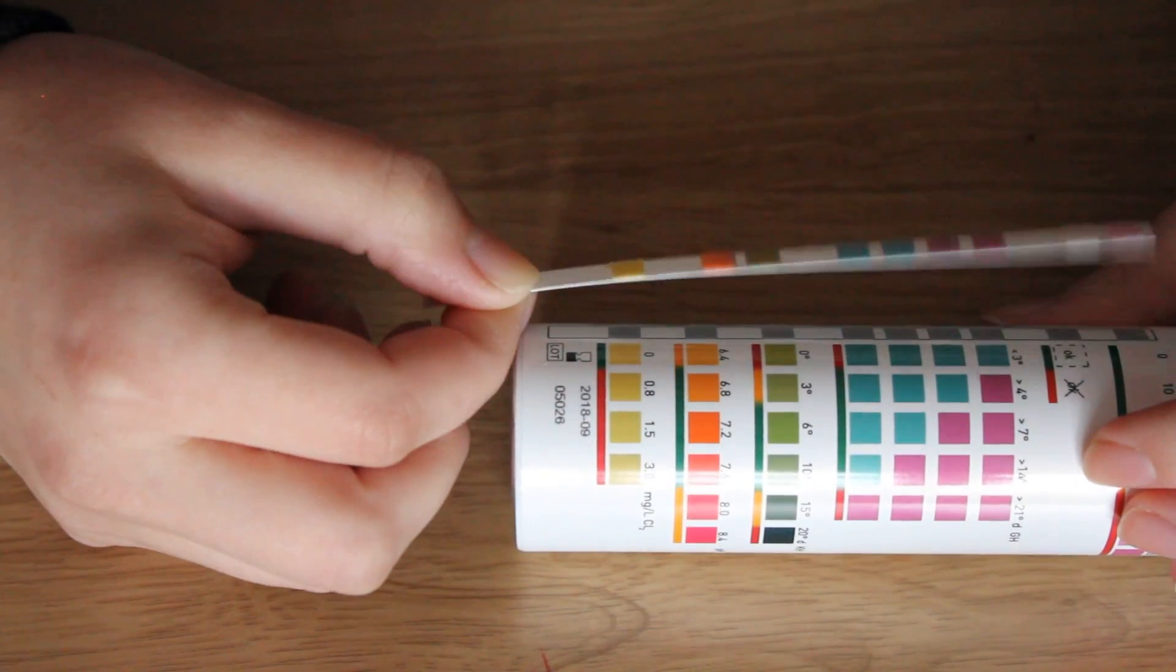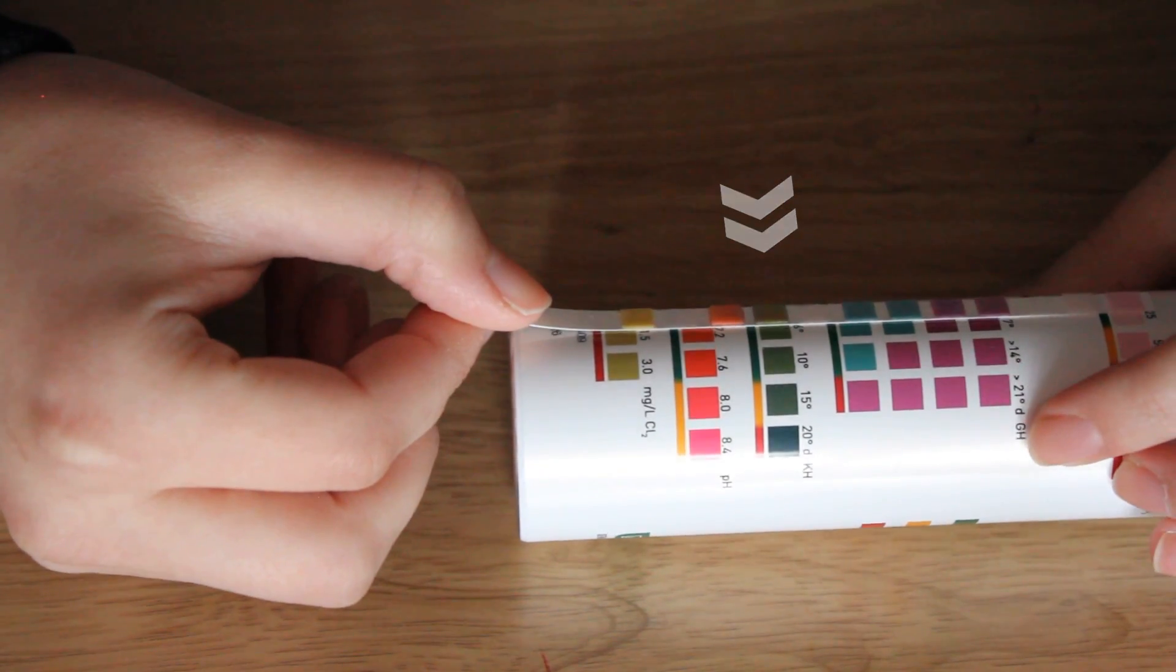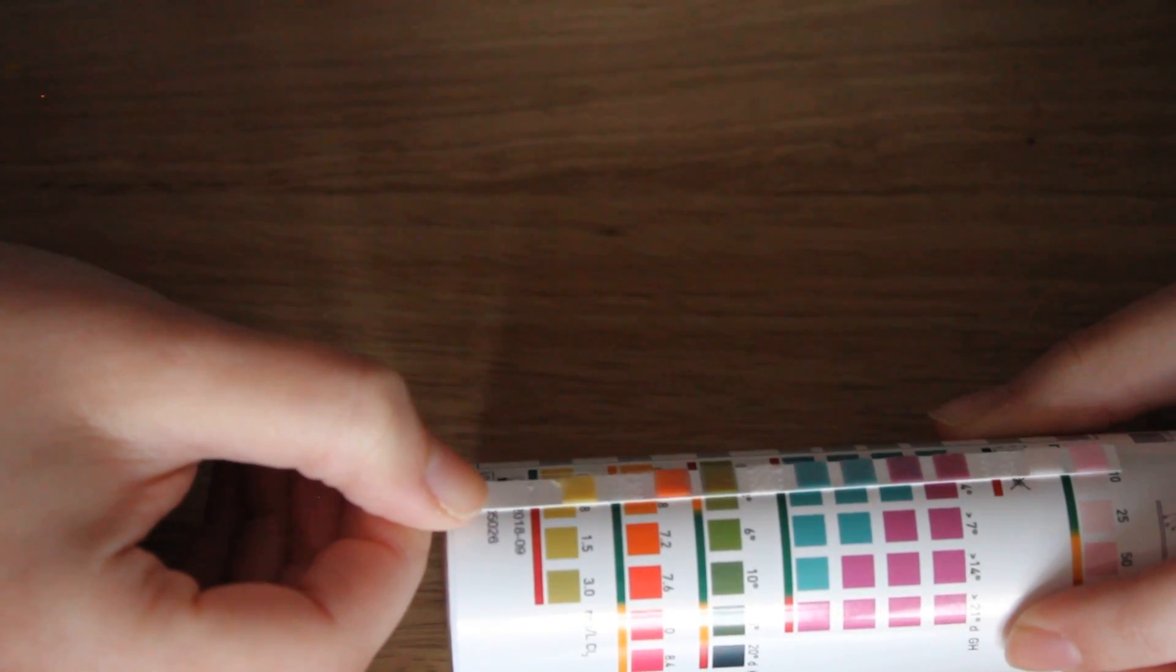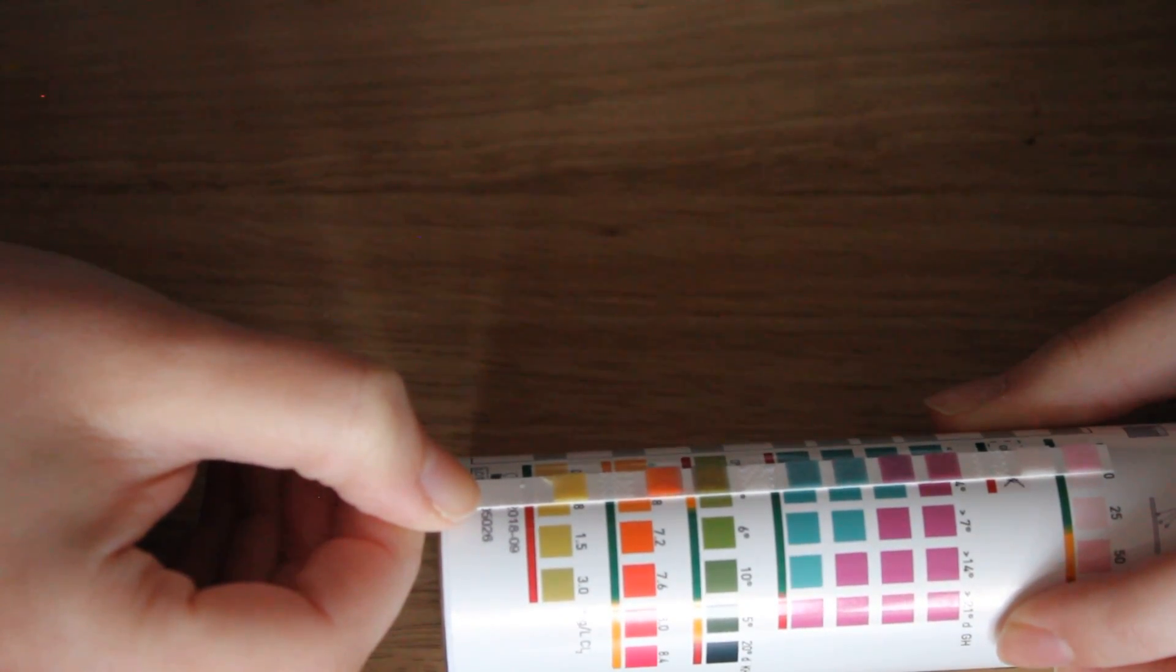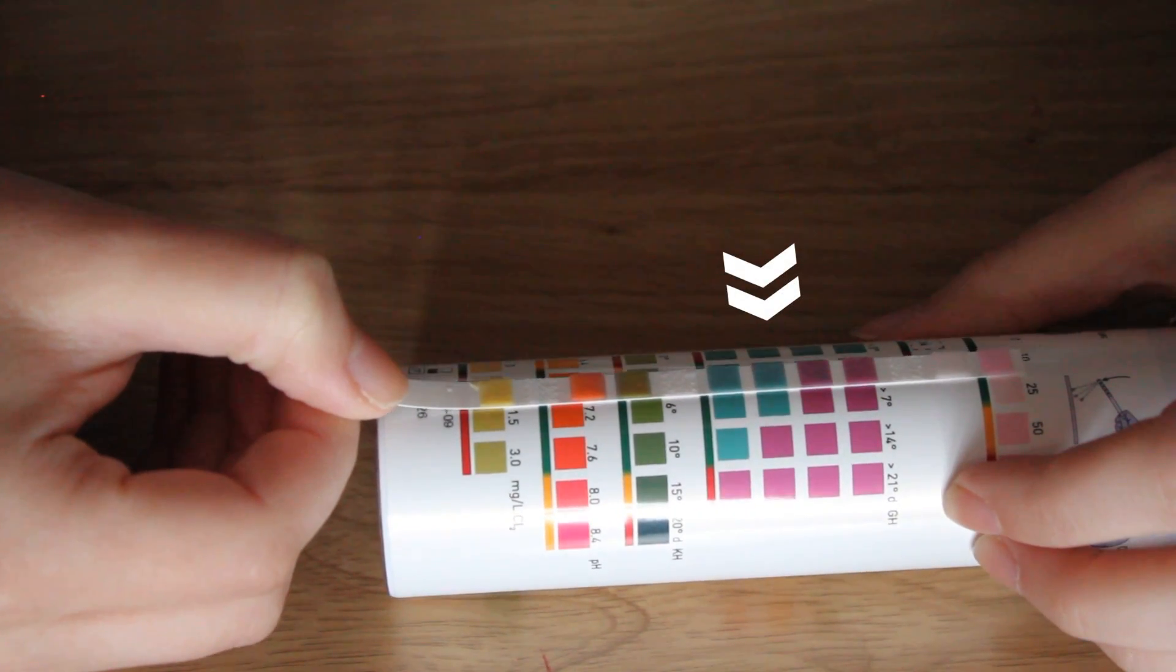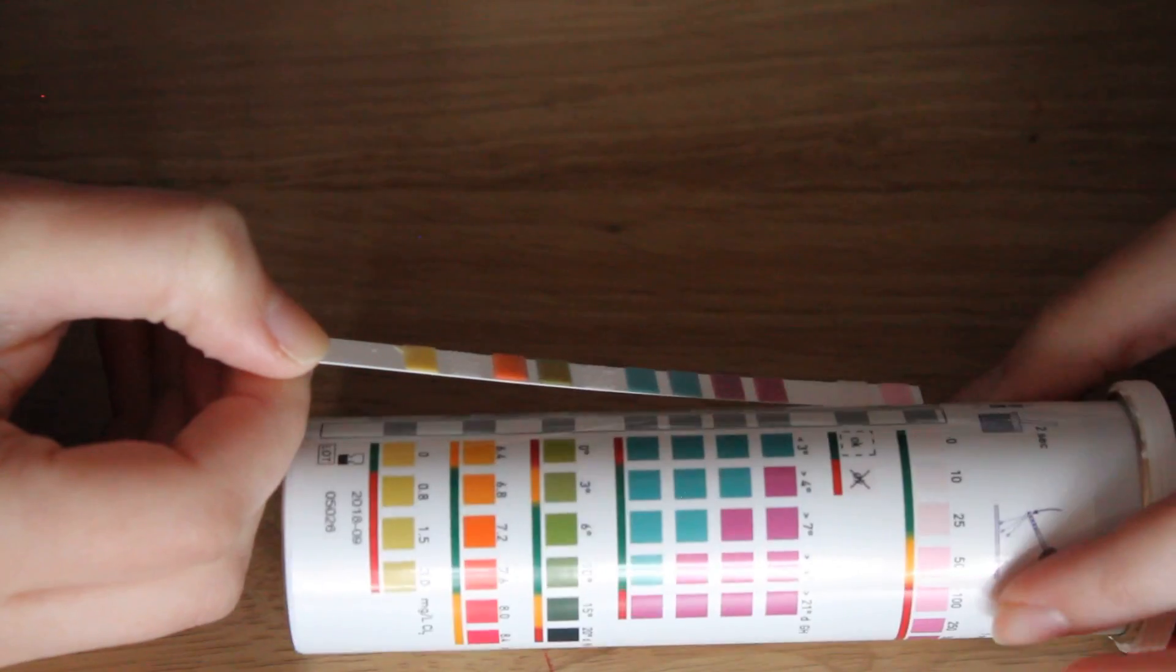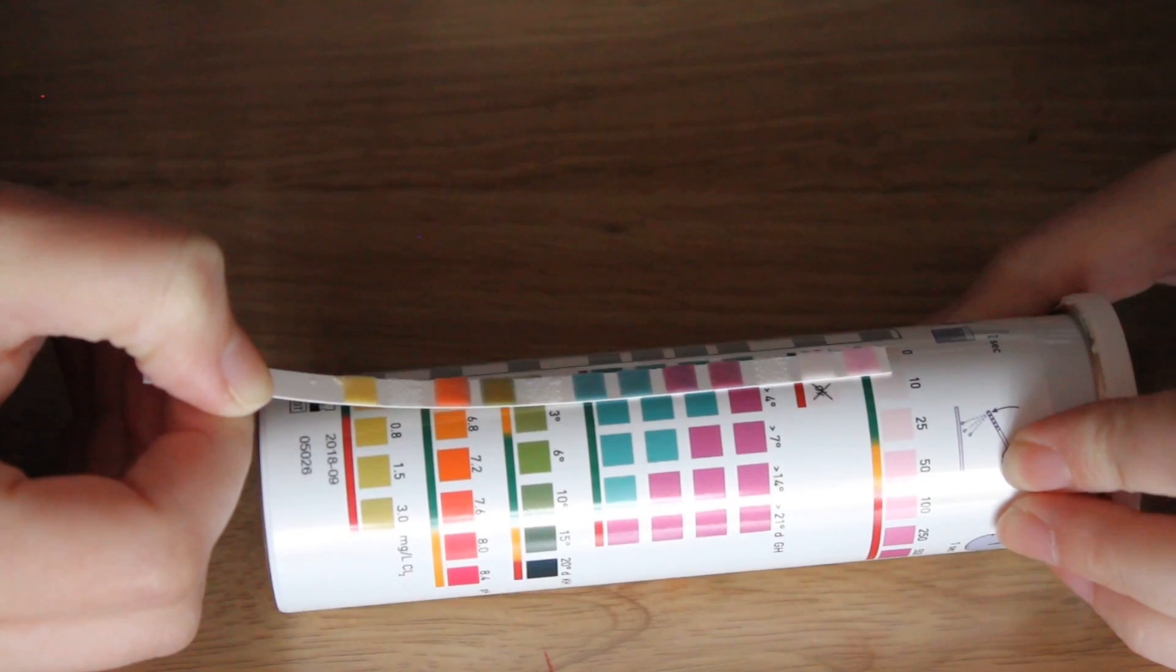Then we have carbonate hardness and we want it to be around here. It looks like it's about three to me, which isn't ideal. Then we have total hardness which looks like it's here, which is less than seven, so that's actually in the green section, so that is good.